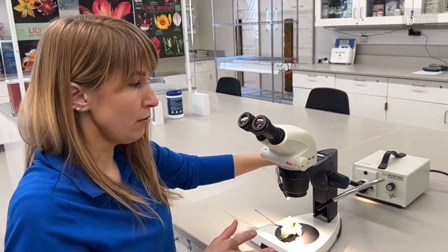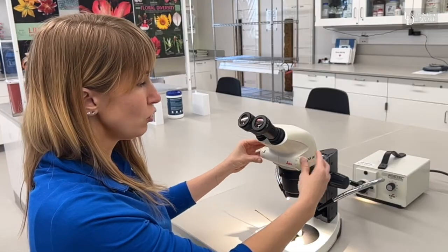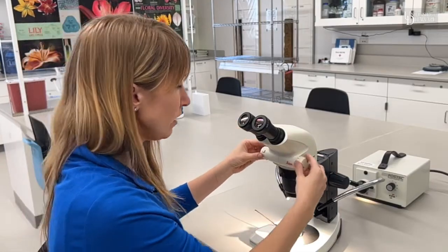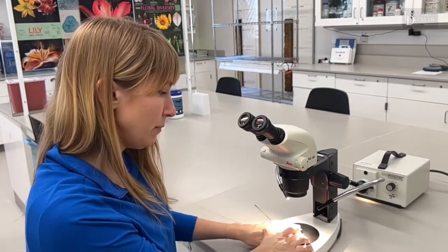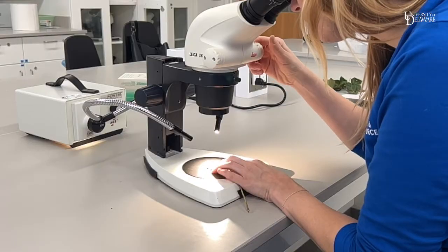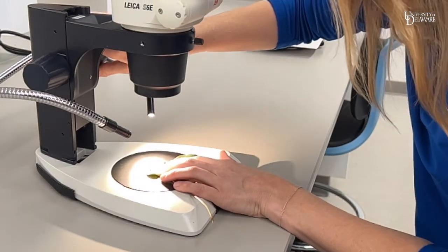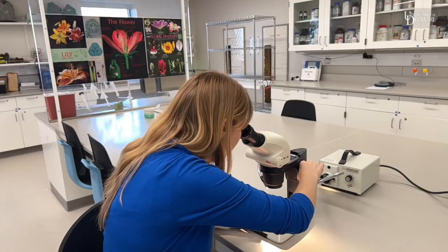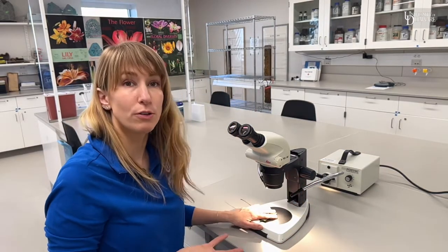The last part of the stereo or dissecting microscope is the zoom, which is usually closer to the eyepieces here. You just move this knob to zoom in. I like to hold on to the sample so it doesn't move while zooming. You'll probably have to readjust your focus after zooming in and out. And that's really the basics of using a dissecting microscope.